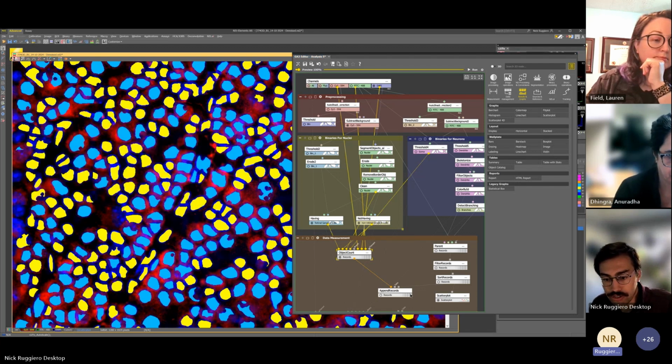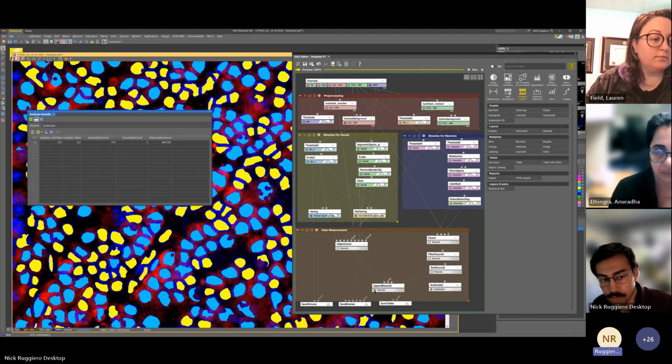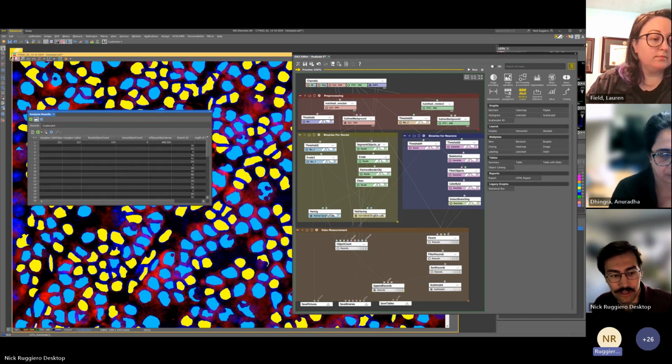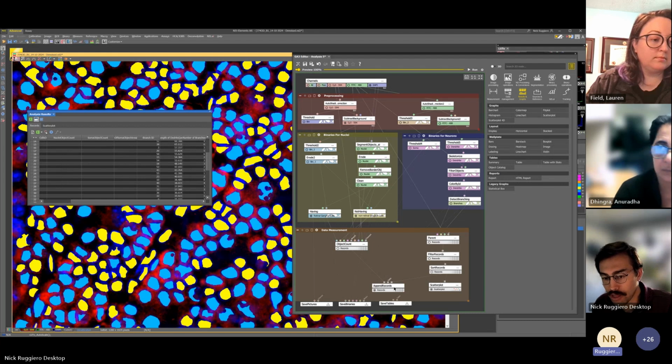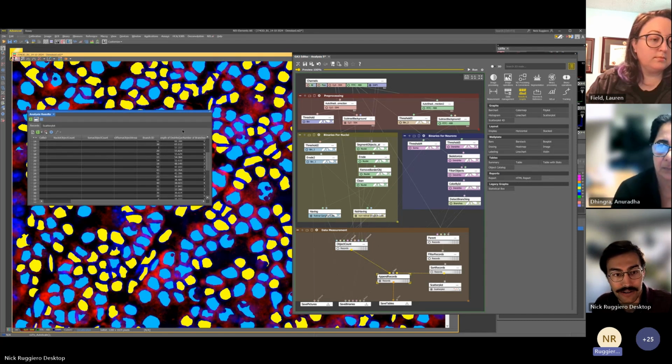And then from there, in order to sort of organize it, I did what we call an append records. Again, this is a really useful tool for getting multiple tables together. And what that looks like is this. This one will look a little bit funky because it's probably not the best. We have data of different sizes, but it will put all of the data that we got into one table that I can then use. I could put my scatter plot onto this. I can make multiple scatter plots from here. I can export all of this data to Excel or export it as like a CSV file, things like that.